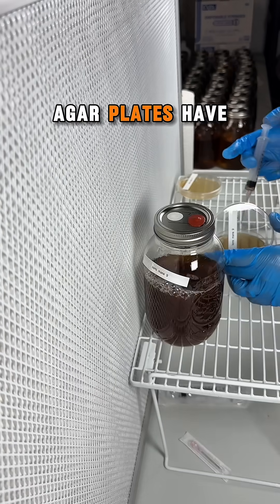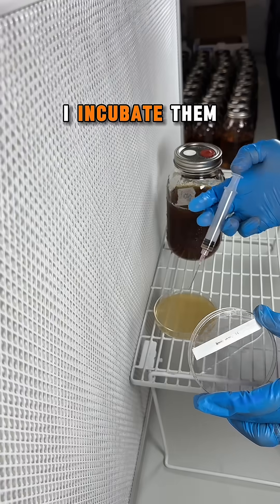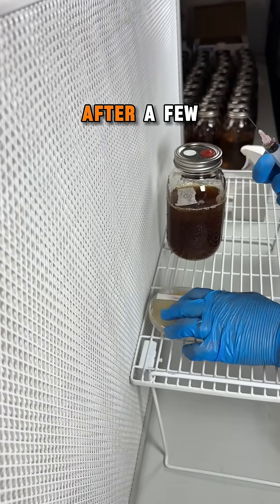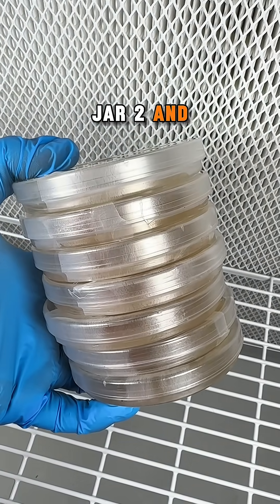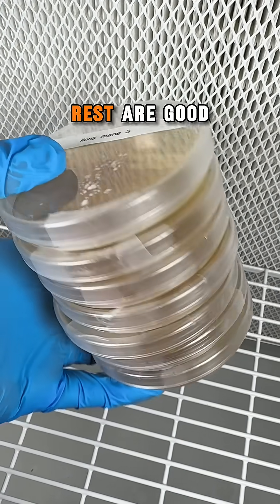Once all 10 agar plates have been inoculated, I incubate them at 75 degrees Fahrenheit. After a few days, the agar plates revealed that jar 1, jar 2, and jar 10 were contaminated, and the rest are good to go.